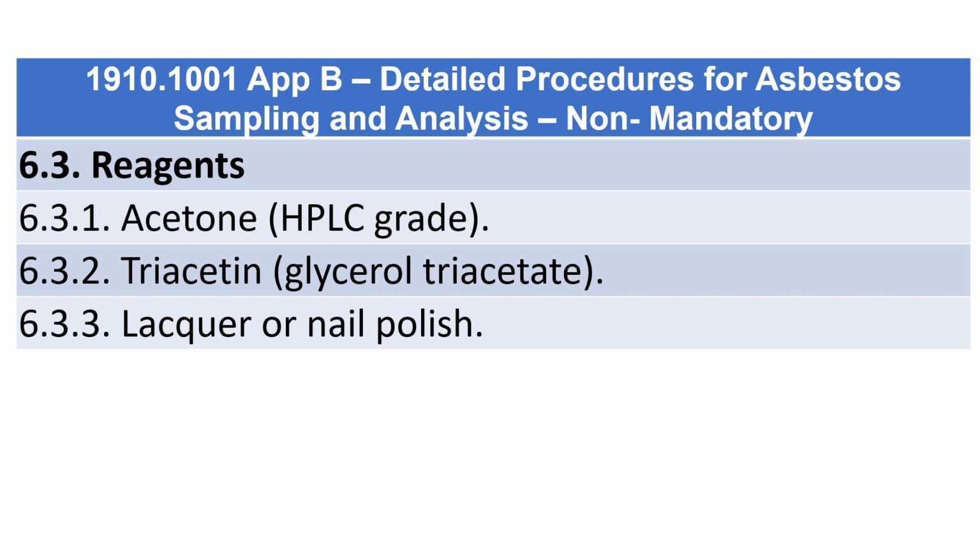6.3. Reagents. 6.3.1. Acetone, HPLC grade. 6.3.2. Triacetin, glycerol triacetate. 6.3.3. Lacquer or nail polish.